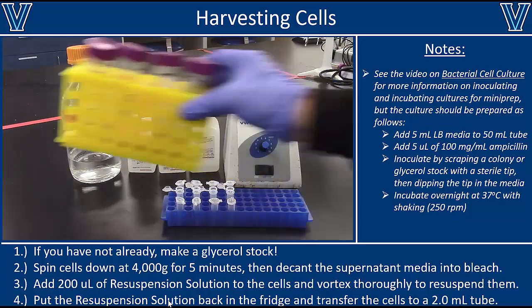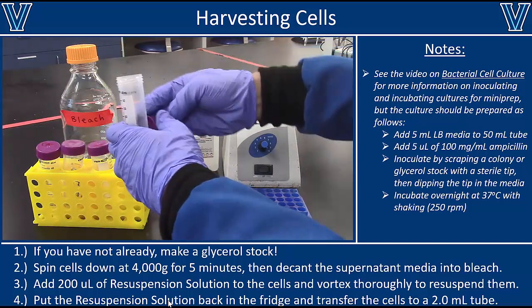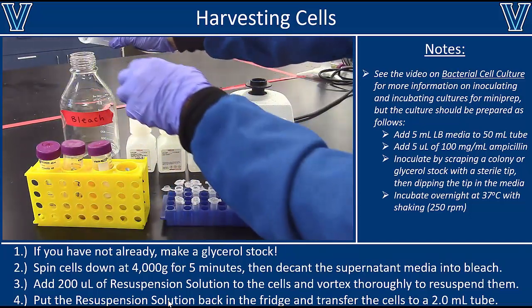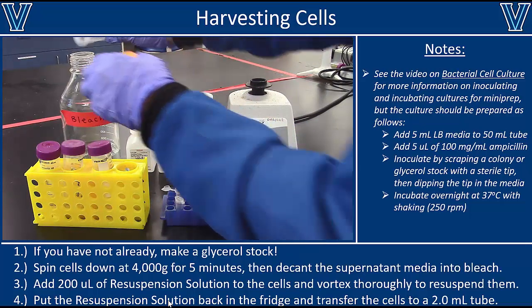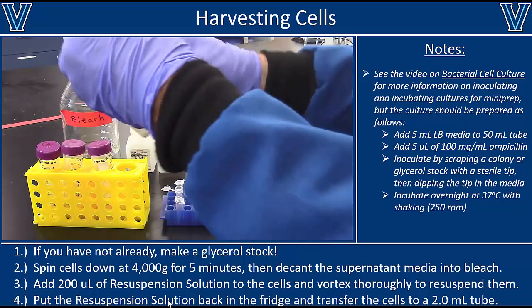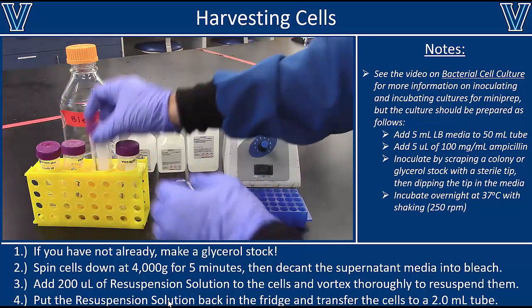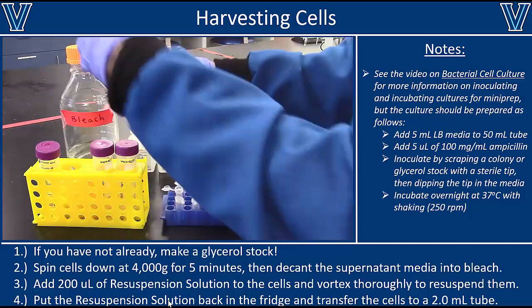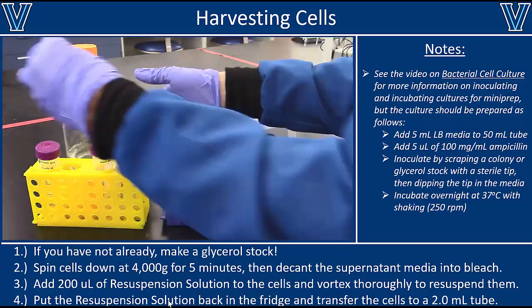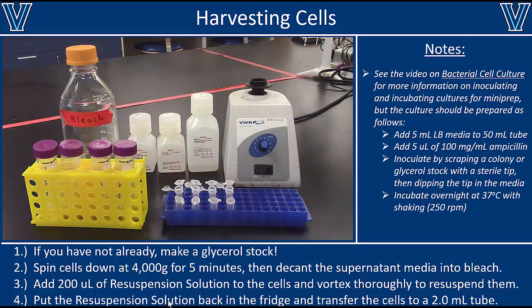All right, so once we have those pellets, the first thing we need to do is get rid of the supernatant media. And that could still contain plasmids and cells, so we decant that directly into bleach. The bleach will kill any cells, it will degrade any plasmid, so that'll just leave us with this cell pellet here. And after 24 hours, we can pour the bleach and media mixture down the drain. All right, so you want to do that for all your samples.